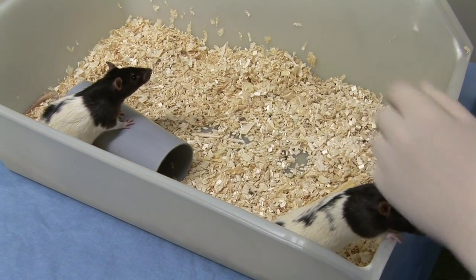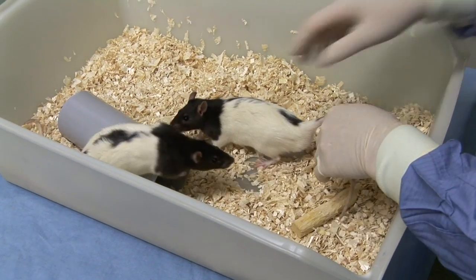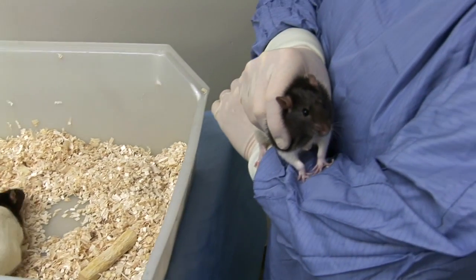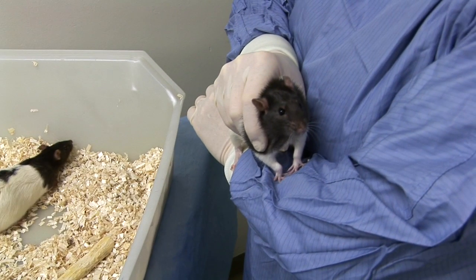If the animal is very active, it can be restrained by holding the base of its tail before picking it up around its shoulders. It can then be held resting against your chest or arm while maintaining a gentle grasp around its shoulders and with its hindquarters supported.